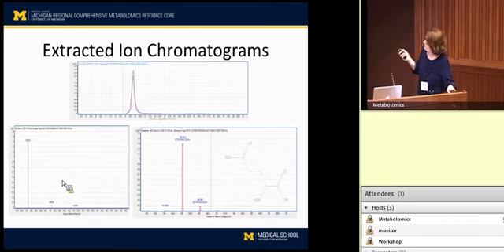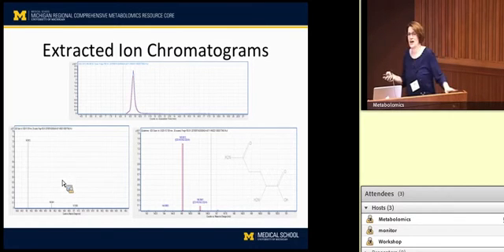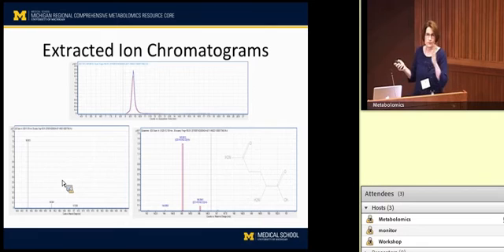So we match it up too, to see if this pattern matches what we expect. If you look in the middle, there's the blue line. That's essentially this peak here, and it's the single centroided part of the peak.